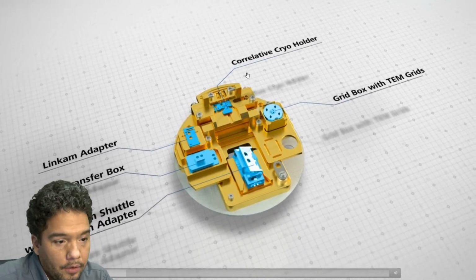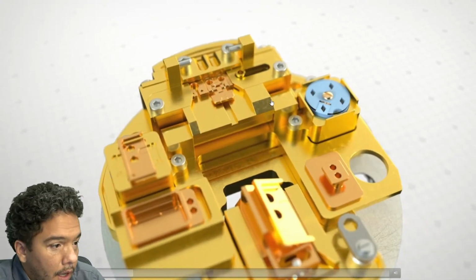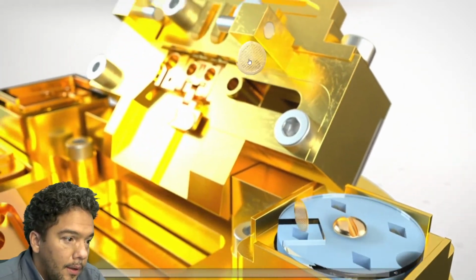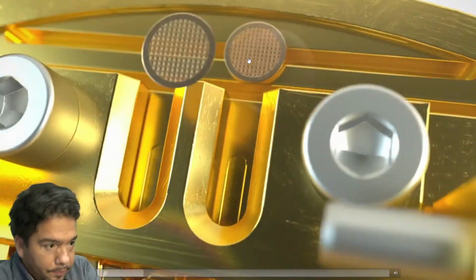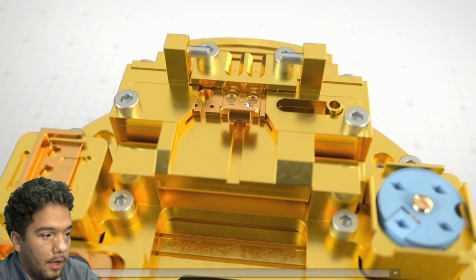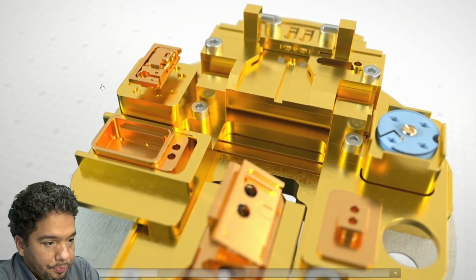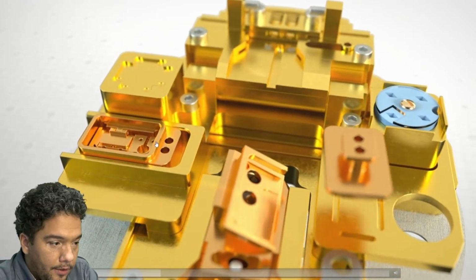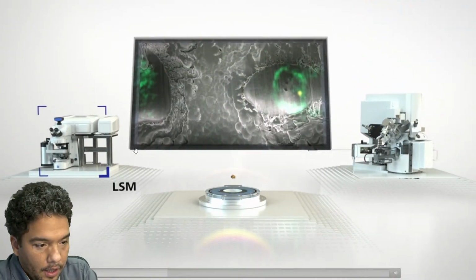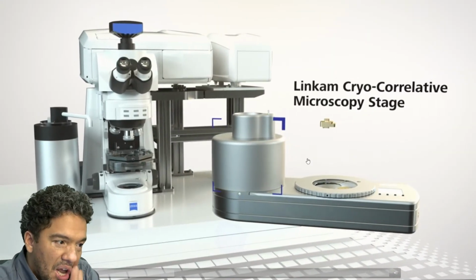We have grid boxes, the correlative cryo holder, and other adapters that go with this kit. Here you can see the grid, vitrified after we got the vitrification, for different kinds of samples or different approaches. We are now loading our samples, our grids, into the Linkam and going directly to the LSM. Here we have the Linkam cryo-correlative stage.